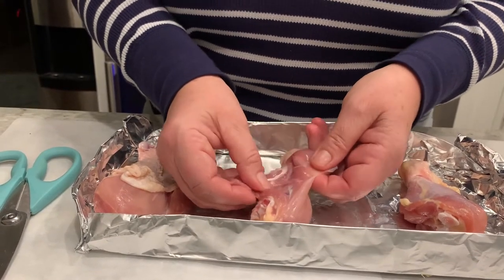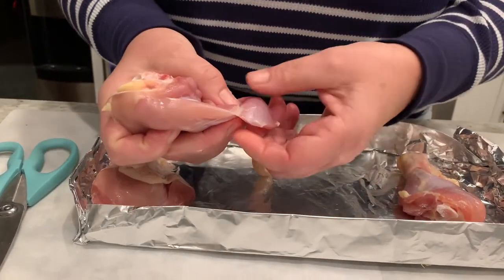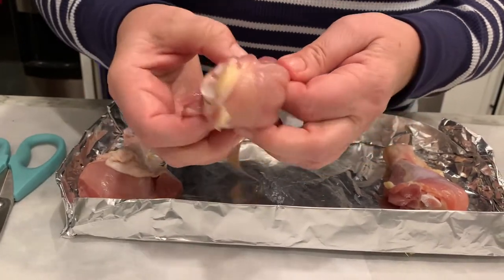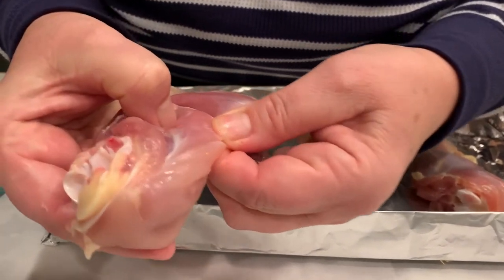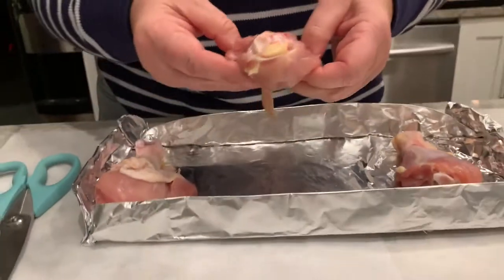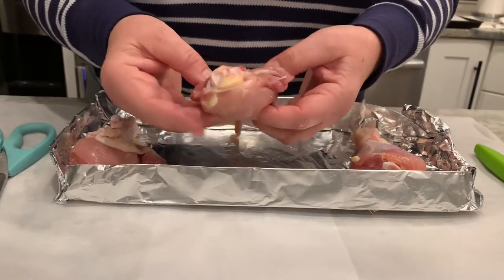This is skeletal muscle, and skeletal muscle has striated bundles of muscle tissue. You can see here's a bundle, and within each one you have smaller bundles. If I pull on the tissue, you can see those striations — this will look different from cardiac or smooth muscle or organ tissue.